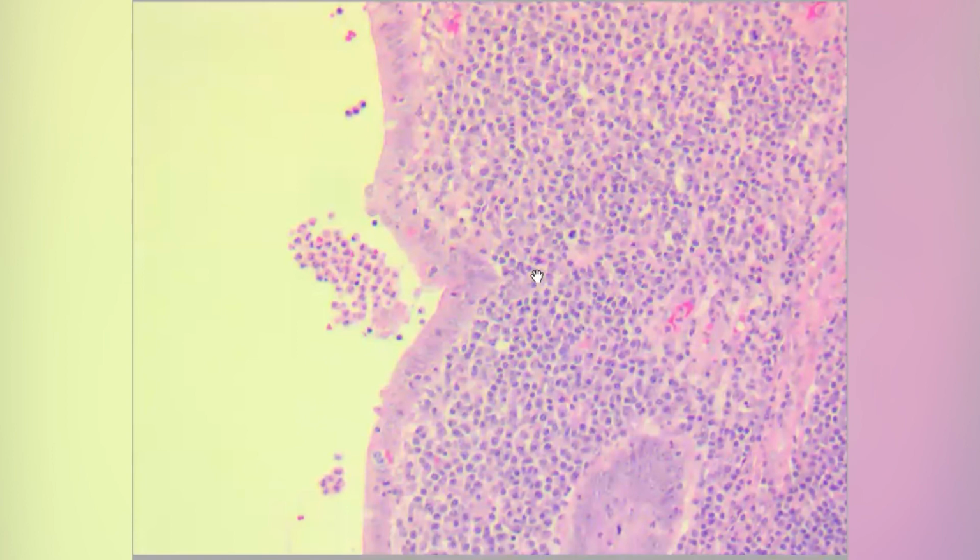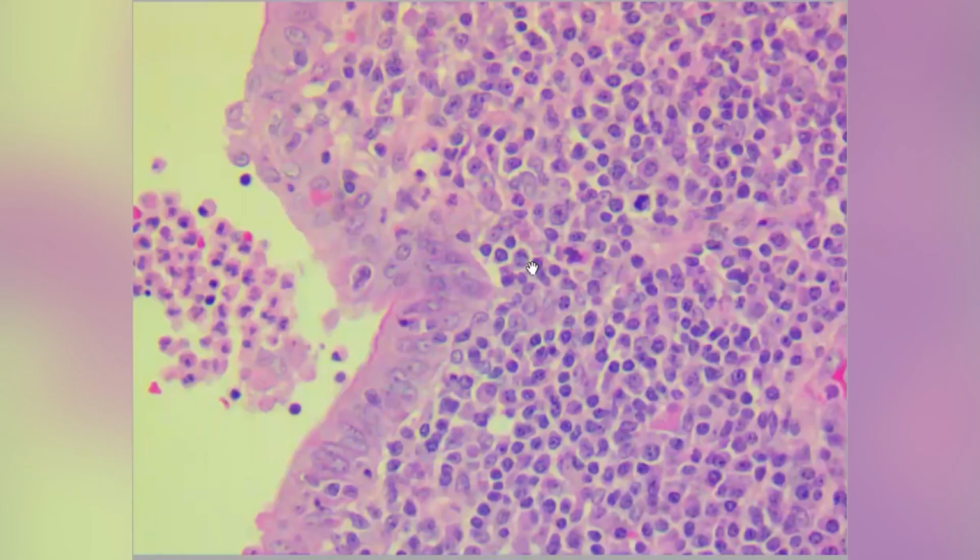Last view will be at the 40x to see the neutrophils. Now we are at the 40x. This is the lumen. This is for sure neutrophils and having some other inflammatory cells. And as you go through the wall of the appendix, you will see and appreciate more neutrophils. But let's go to the muscularis propria and confirm our diagnosis.